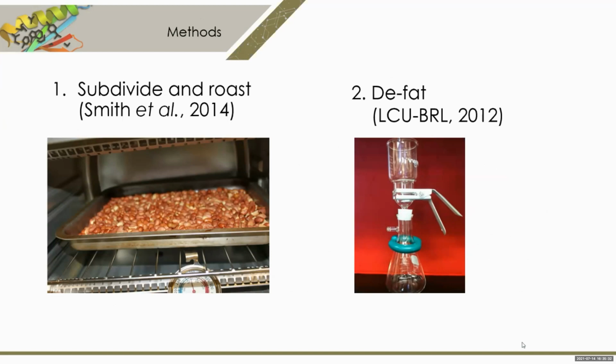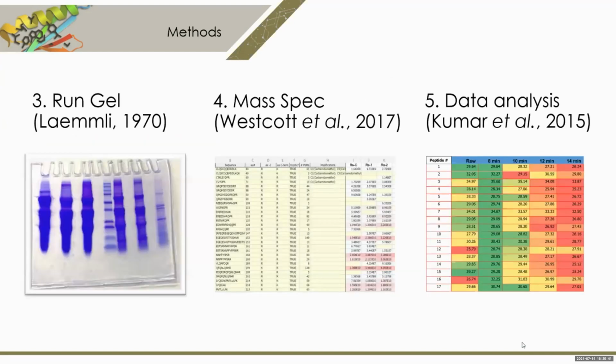Peanut roasting, blanching, and sensory analysis were conducted according to published methods. Samples were defatted according to our lab protocols. Defatted samples were separated by SDS-PAGE electrophoresis. We either ran the gel for a limited time and pooled all of the soluble protein, or we ran the gel to completion for better resolution of individual protein bands. The gel band or bands are excised from the gel and shipped overnight with temperature control.